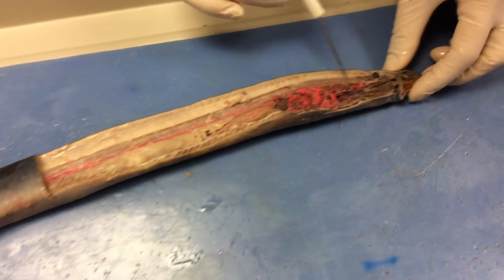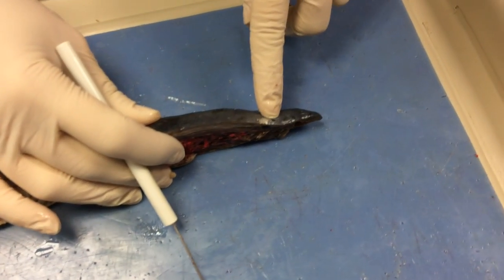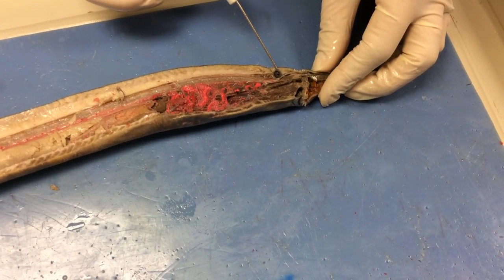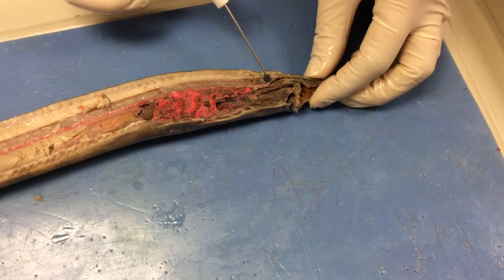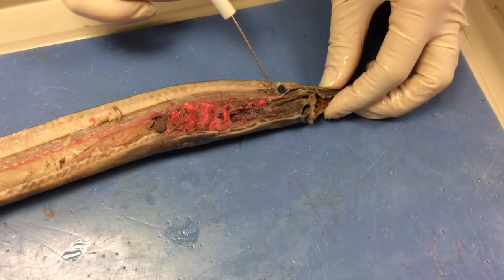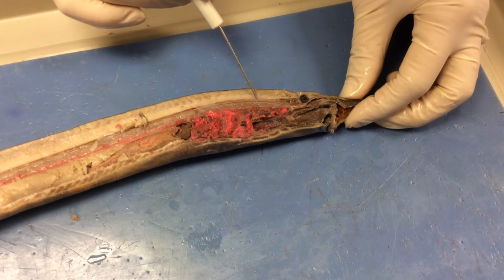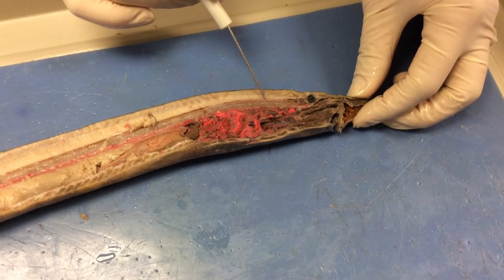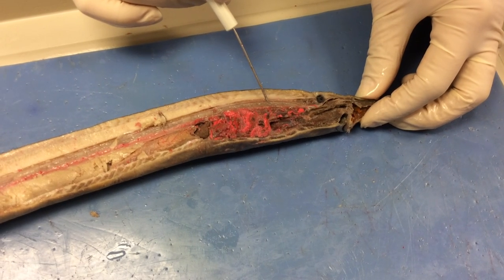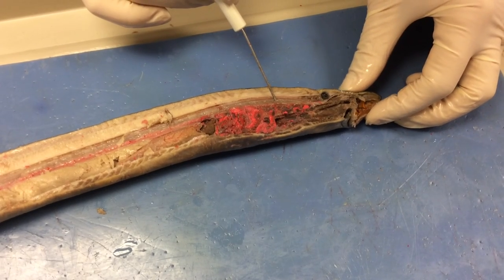Okay, as we go back up to the anterior region, we take a look at our medial nostril on the top, and as we follow it internally, we're going to notice that there's a dark structure right here, and that's going to be the olfactory sac. Just posterior to the olfactory sac is going to be the brain. The brain then, of course, is attached to the spinal cord, which is this structure that you see here. Just ventral to the spinal cord is going to be the notochord. Now remember that these organisms are cartilaginous, and so the notochord doesn't actually calcify over.